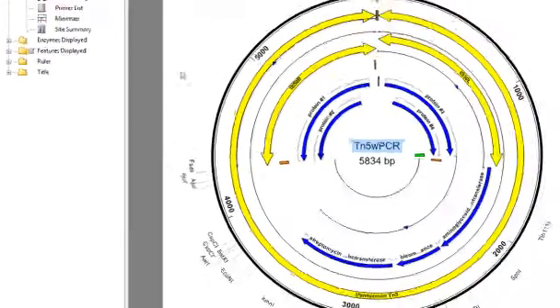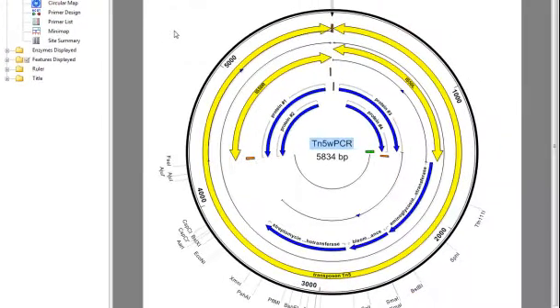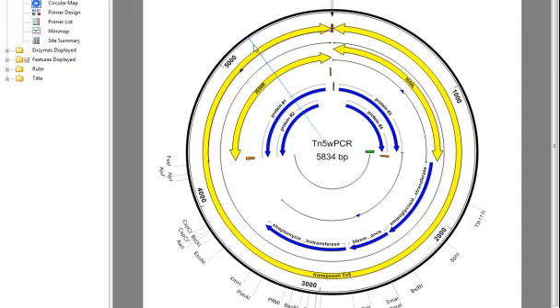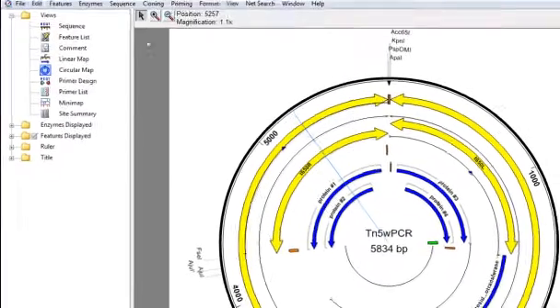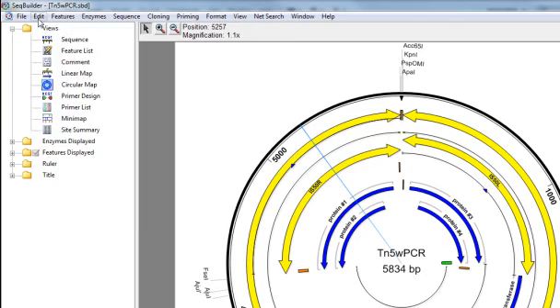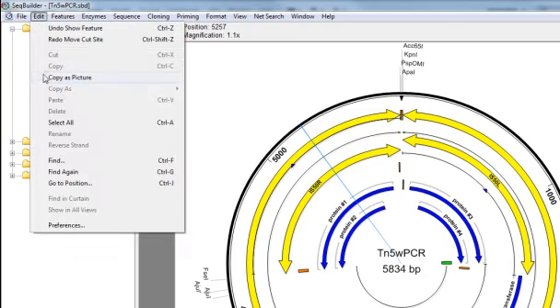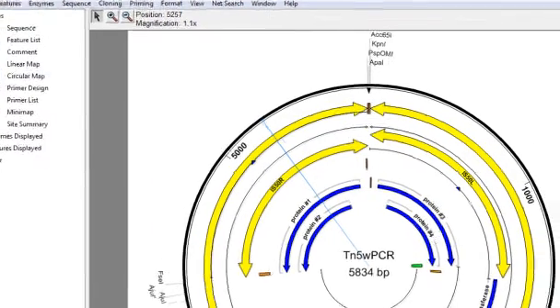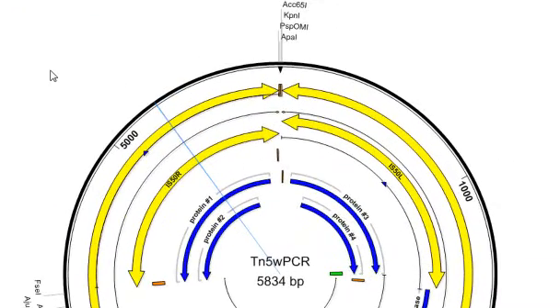You may want to use the circular map as a graphic in a presentation or paper, and you can do that by copying and pasting. To copy the circular map as a vector graphics file, just select Edit, Copy as Picture, and then you're ready to paste it into the other application.